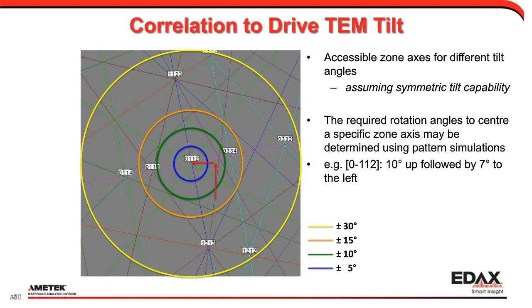And by knowing the ranges that are available on our stage, we then know which grains would be within range for diffraction imaging. So we can set a tolerance angle on the map to say, show us all the grains within, say, 15 degrees of the normal, and those particular grains would then be colored and illuminated and can help drive the TEM analysis.